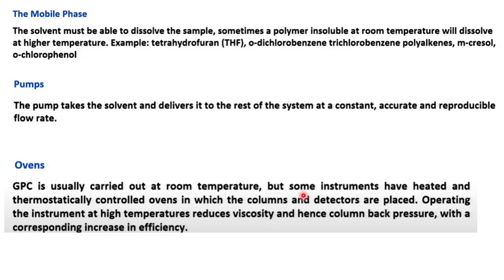After dissolving, first you should prepare a very dilute sample, around 1 mg per ml. After complete dissolution, you should filter it through a nylon filter of around 0.22 micrometer pore size, and then that filtered sample will actually be used for the GPC technique.